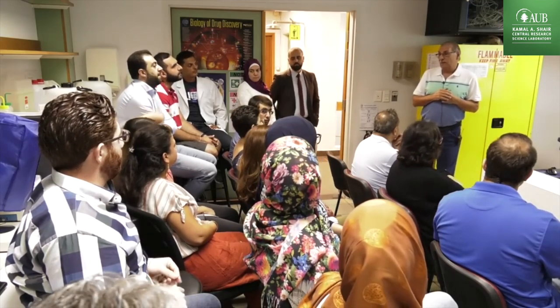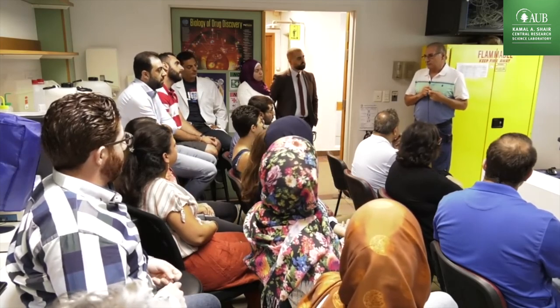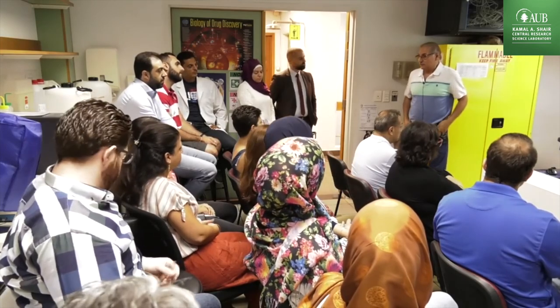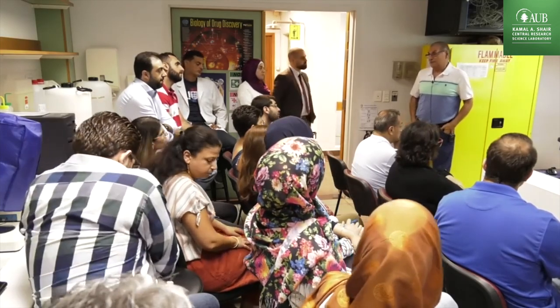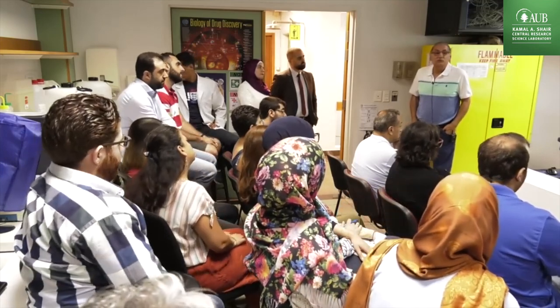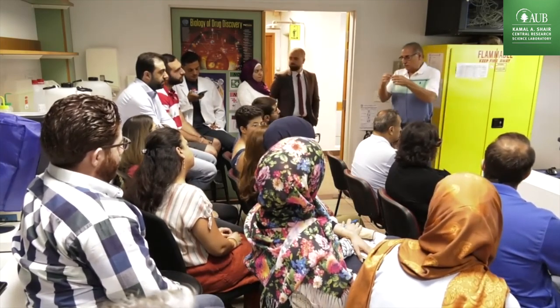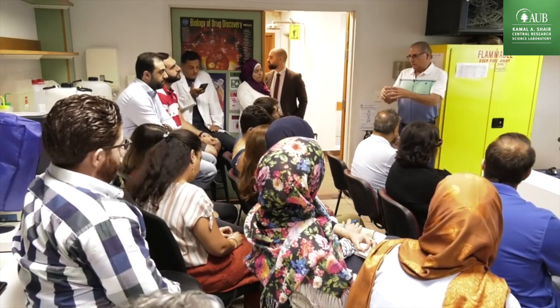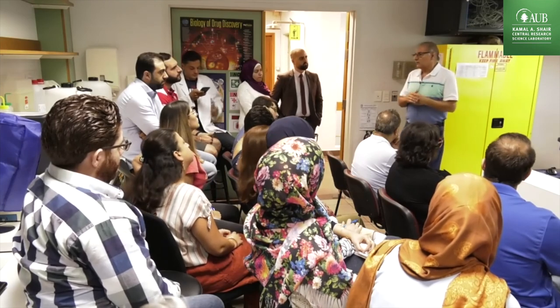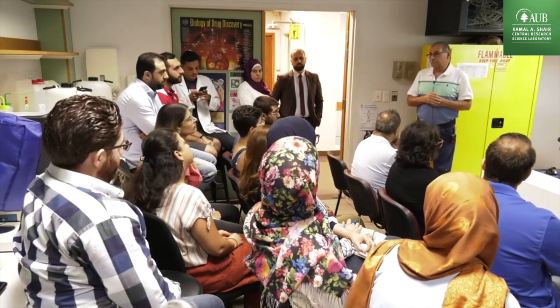Does it have a gas loop? It has a loop, of course. For the pulse chemisorption, we have its own calibrated loop. So you inject and you know the TPR, you get the pulse chemisorption to quantify the dispersion of the metal. Of course, if you don't have a loop, you're missing half of the information. It has a loop and has TCD, so everything to do with these techniques. Some people build their own reactor: as long as you have an oven and you can control it, you connect the inlet and outlet to the system and you can do TPR, pulse chemisorption, anything you want. Just TCD.